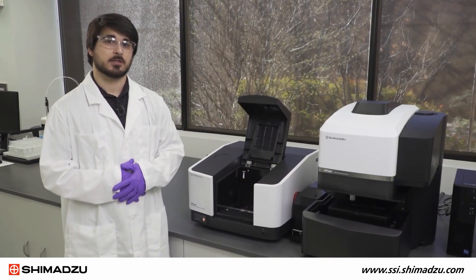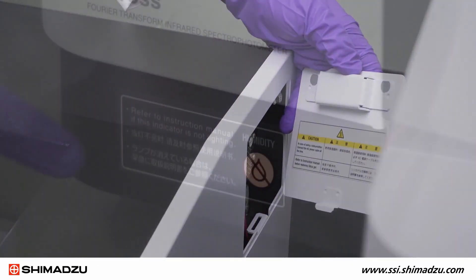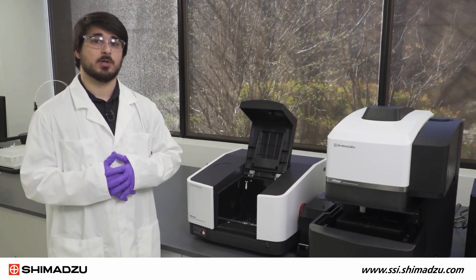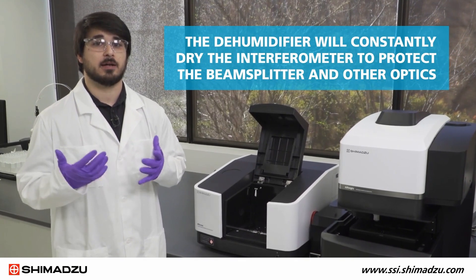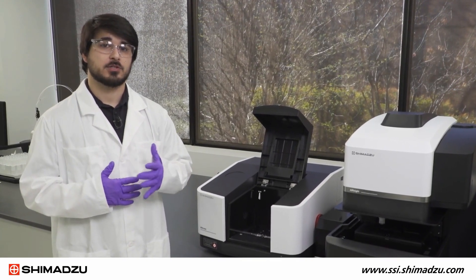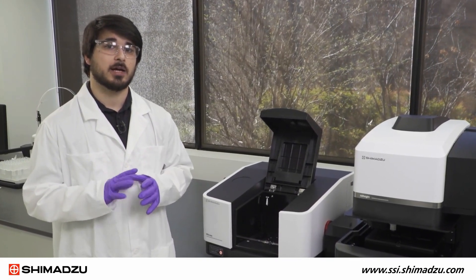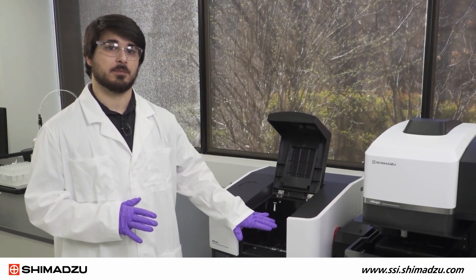The IR CROSS has an optional dehumidifier located back here and the dehumidifier indicator located up front. As long as the unit is plugged in, it will be constantly drying the interferometer to protect the beam splitter and other optics. Additionally, the IR CROSS can be outfitted with a purging unit to push dry air through the interferometer, the detector, and the sample compartment.